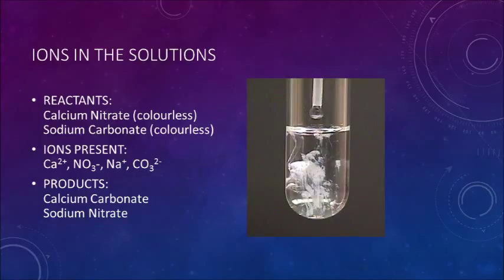Calcium nitrate is a colorless solution, while sodium carbonate is also a colorless solution. When these two solutions are mixed, an insoluble gelatinous precipitate forms.